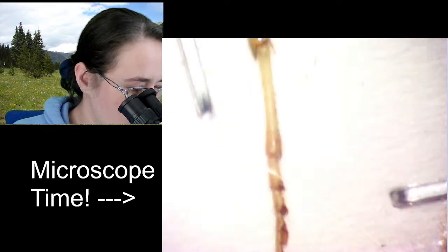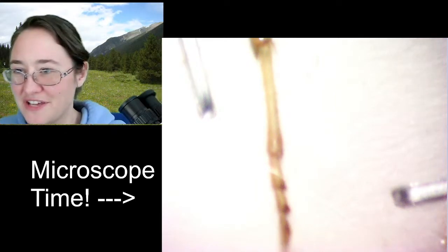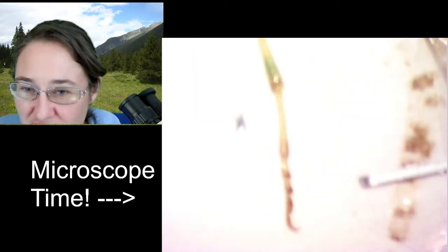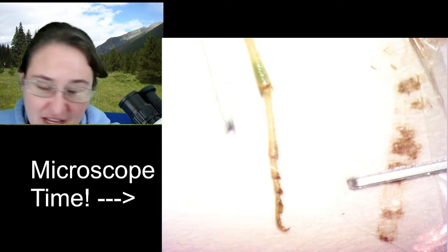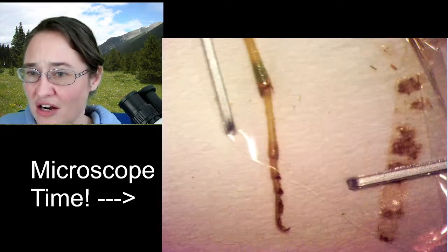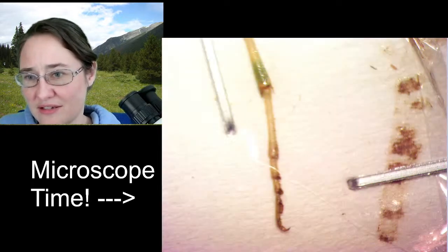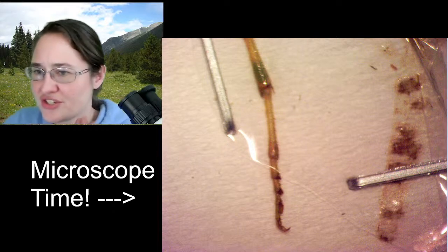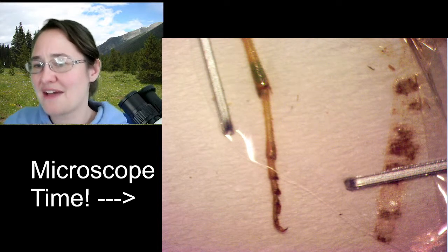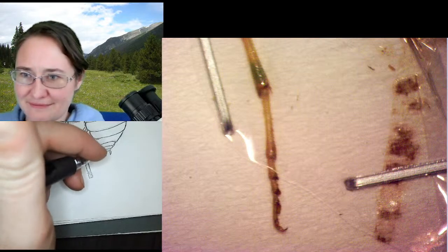Let's see. 1, 2, 3, 4, 5. This one is definitely 5 tarsal segments. So, maybe the middle and the hind legs have 5 and the front legs have 6. The front legs are unique and significantly different than the other 2 legs. So, it's fair that they have a different number of tarsal segments. It's just, sometimes I have to double and triple check myself with counting.